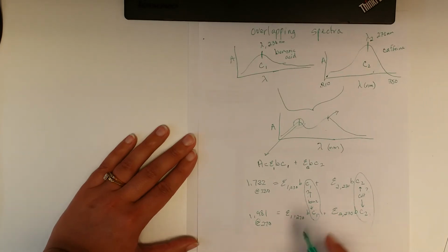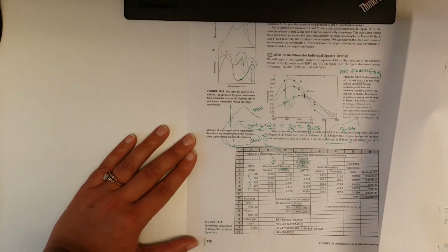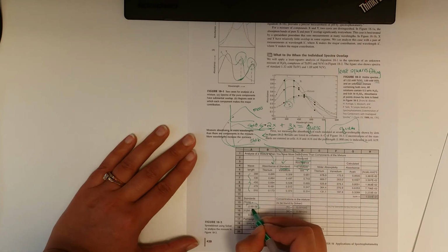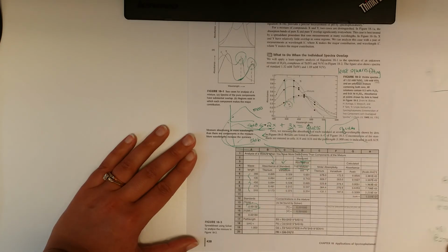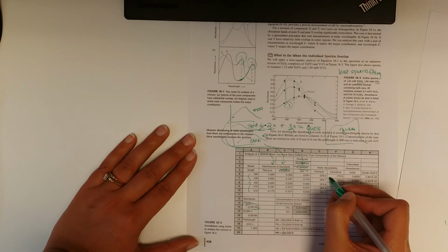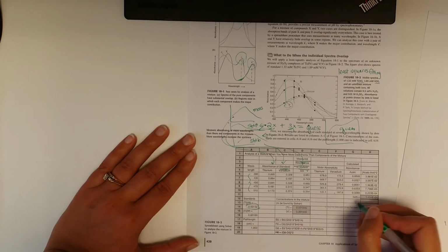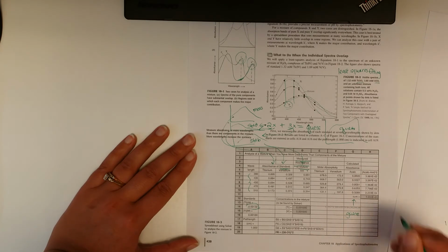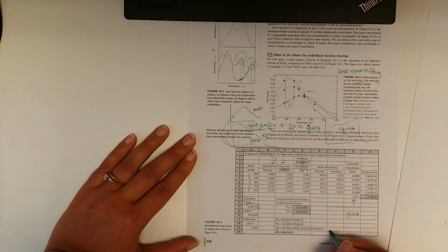And then, just like before, because it is our theory, our fact that things add up, okay, we still need the epsilons. In order to get the epsilons, well, you need to know the concentration of the standard so that you know here. And you use that to calculate epsilon for the standard at each wavelength. Then what we do is we guess. So this is our guess. And it'll tell you cell G6 is here.